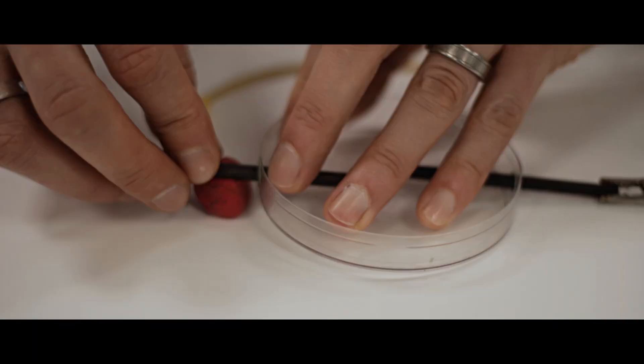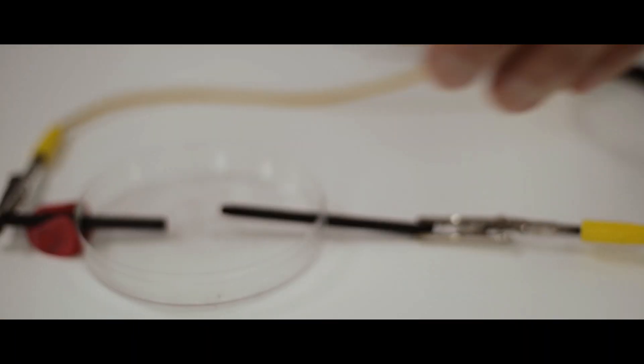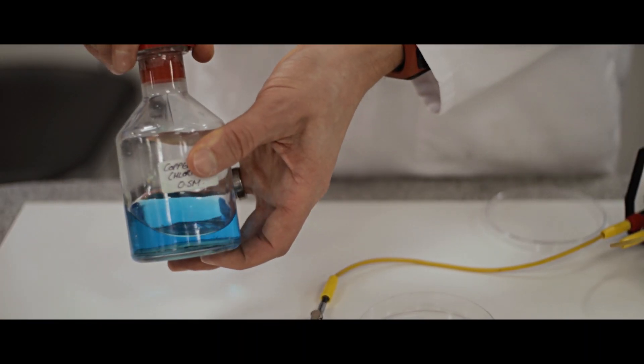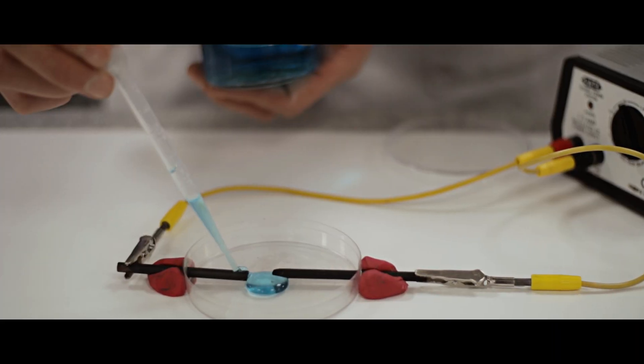We use some plasticine to hold these electrodes in place. Those electrodes are now nice and secure. This is going to be the electrolyte - copper chloride. I'm going to place a few drops until those electrodes are connected.